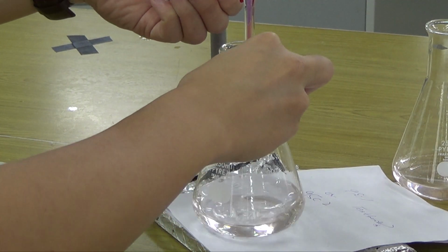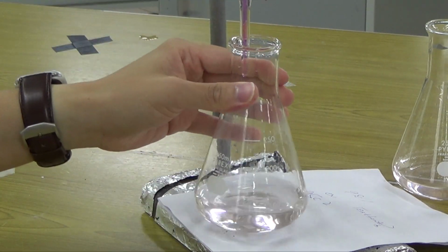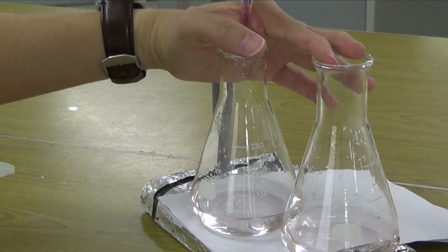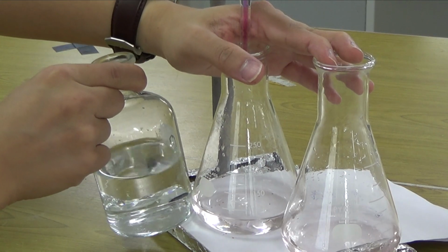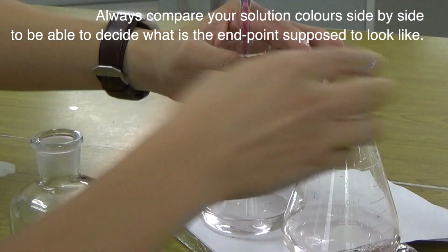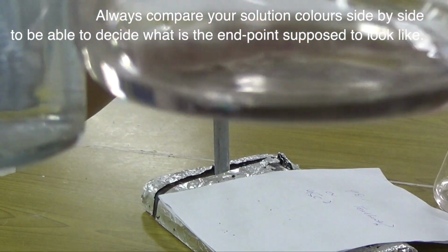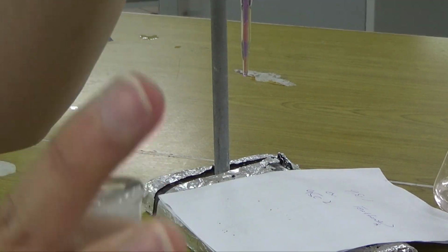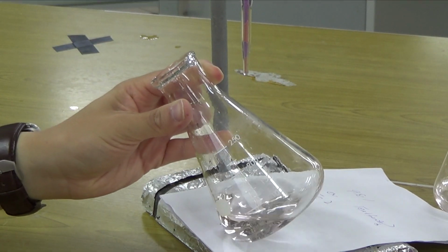Has it changed? I probably need one extra drop. I think it has slightly changed because it's getting pale pink now. Okay, maybe one extra drop, but no, I think it has changed. Not too sure how clear it is, but one is supposed to be the original colorless, and this is a bit pale pink. It's probably better on the contrast there.